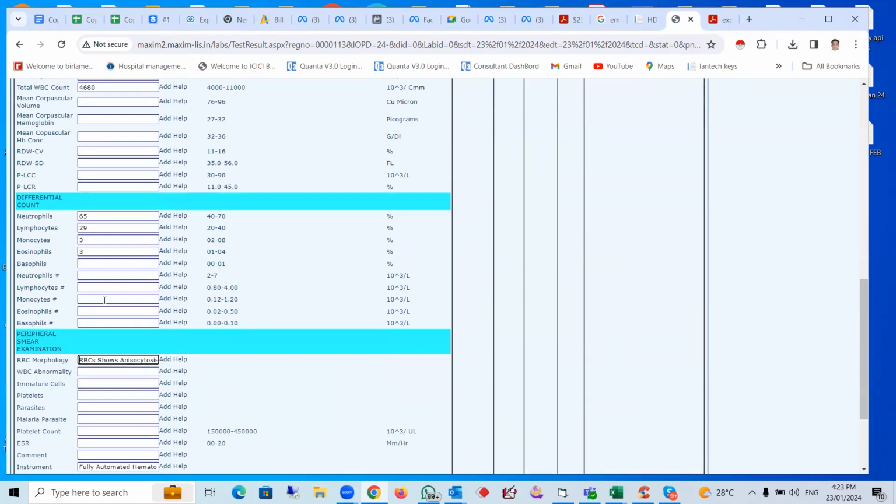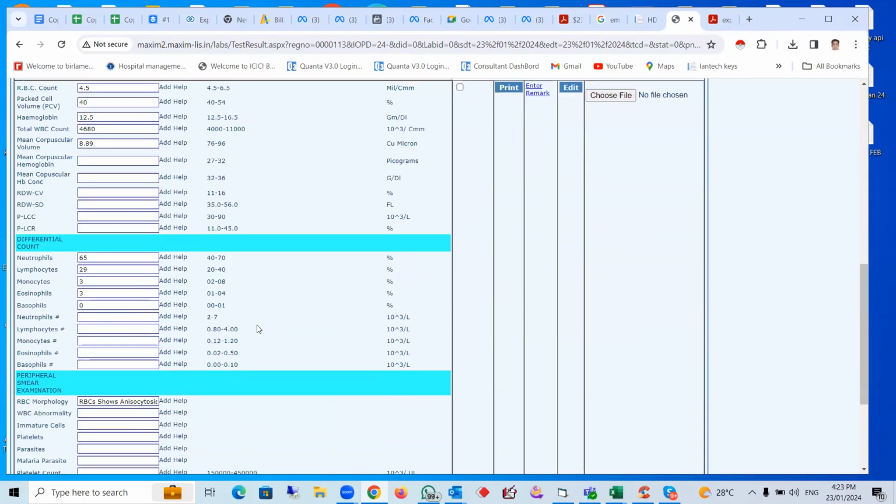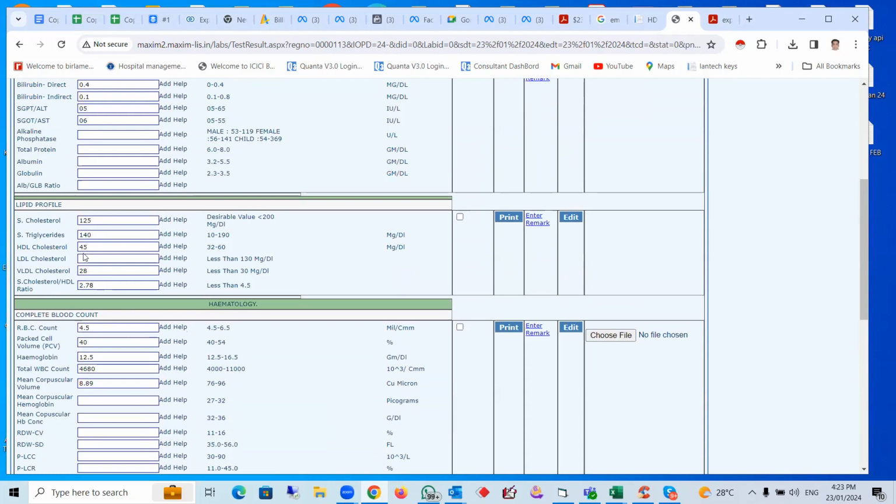So once some data has been entered, there is a command called calculate. Just press this command, and the values will be calculated. It will calculate depending on the formulas which are entered. See, it has calculated here. Okay. Now here, I'll just type something over here.